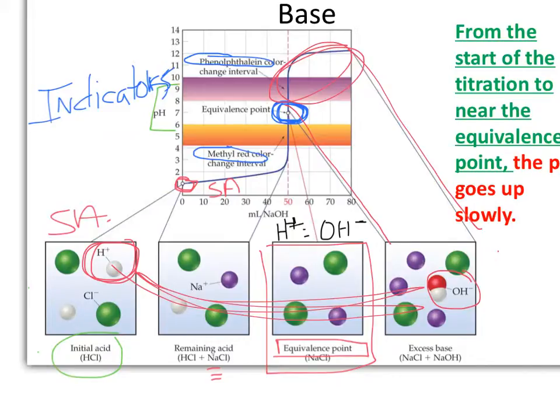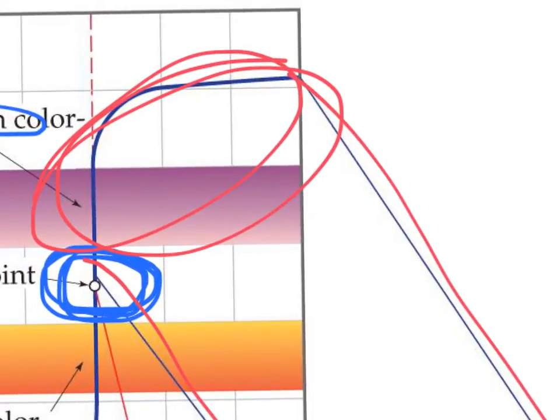Now, I'm going to try to zoom in to show you this. Why does the pH not just continue and continue to rise? Because you're at the pH of that base. Exactly. That base that we're dripping has a certain pH, and it can't exceed that regardless of how much we put in. That's the exact reason why. We're only going to be able to add as much OH minuses as the solution has present in it. So we basically exhausted all the OH minuses. Okay, it's a perfect answer.